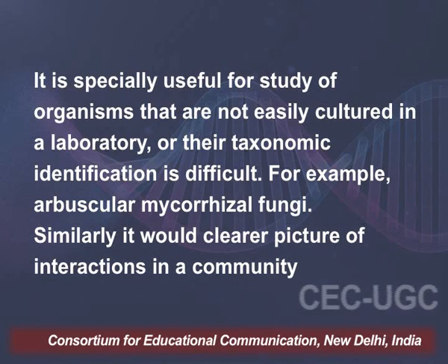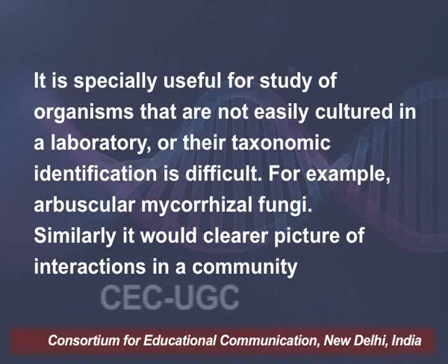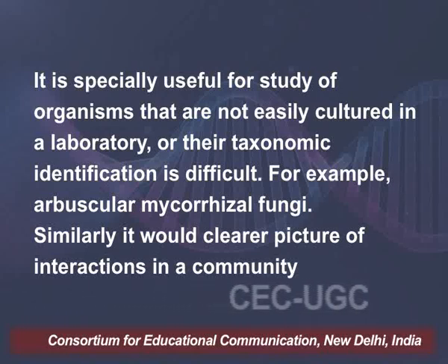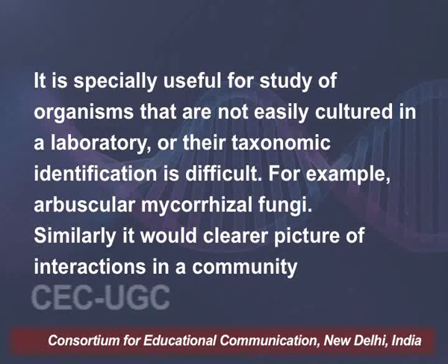So we study a microbe as a gene sequence, or as a part of its genome, and we consider them as a proxy for species. These metagenomic methods, we learned, are especially useful for the study of microorganisms that are not easily cultured in the laboratory, or whose taxonomic identification is difficult for certain reasons.